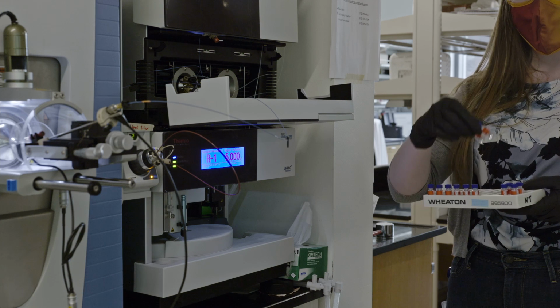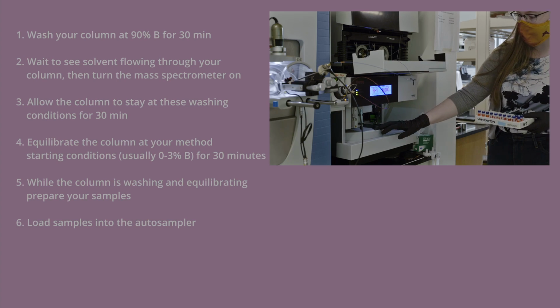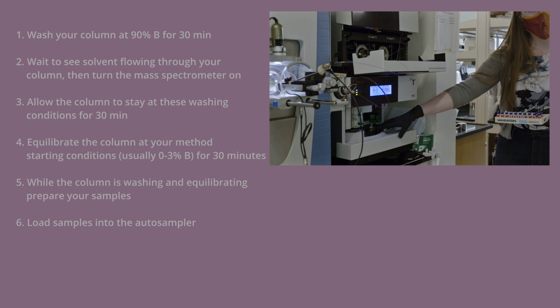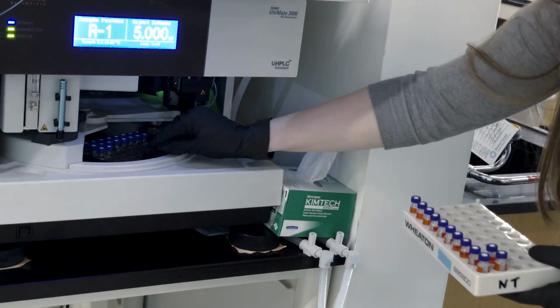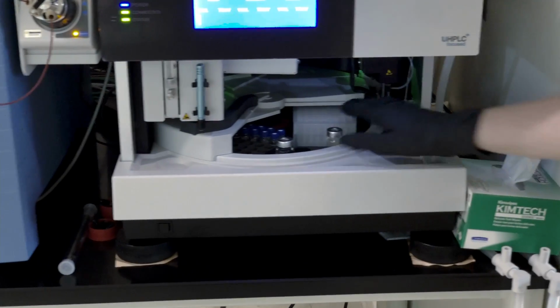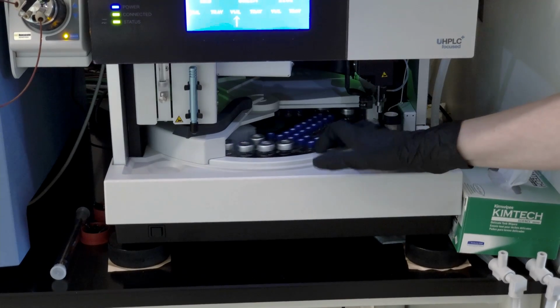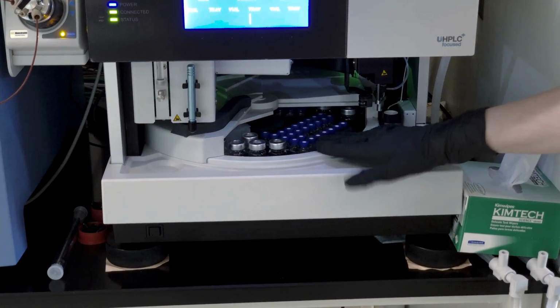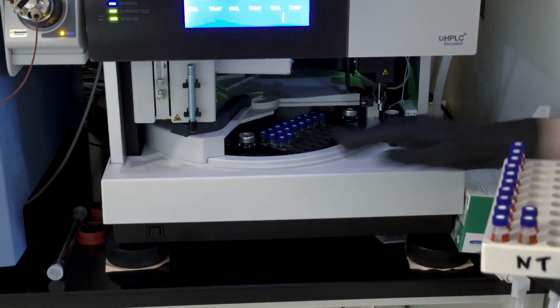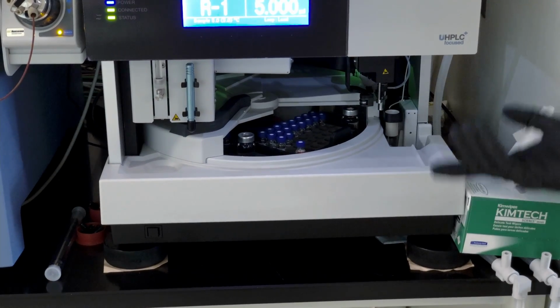And then you'll want to have your samples in your vials. To get your samples onto the instrument, we'll slowly open this cover for the autosampler, and you'll see 3 trays here. They are labeled blue, red, and green in the center of this autosampler. To add samples in a vial, just pick an open spot and set your vial in, and just make sure you remember where you put it.